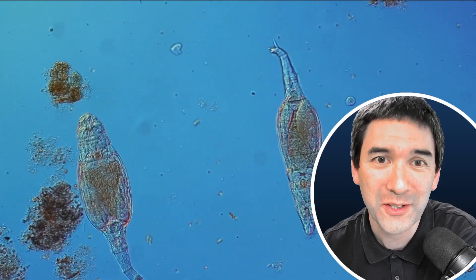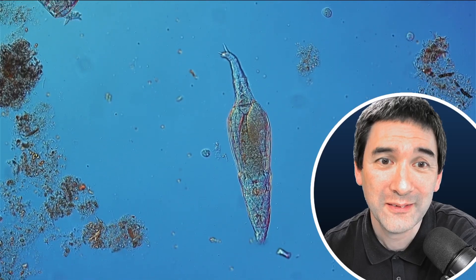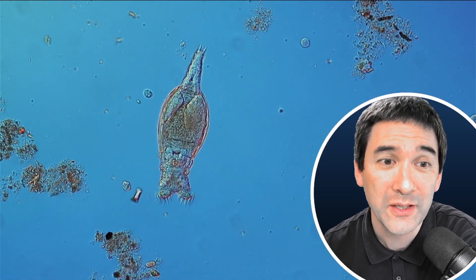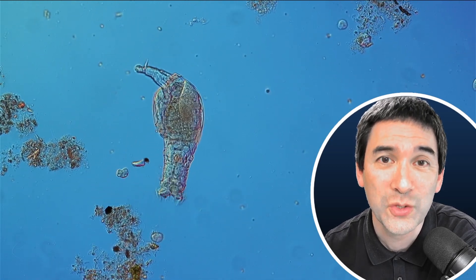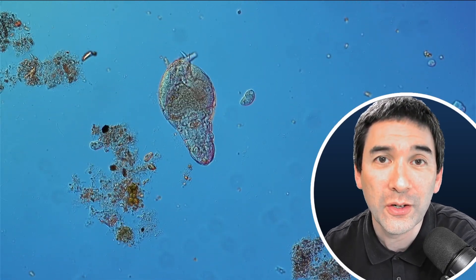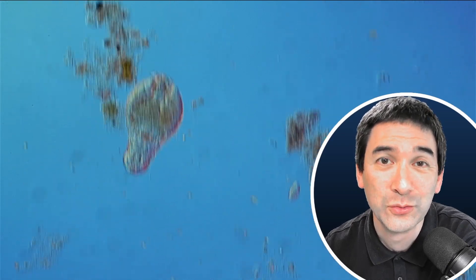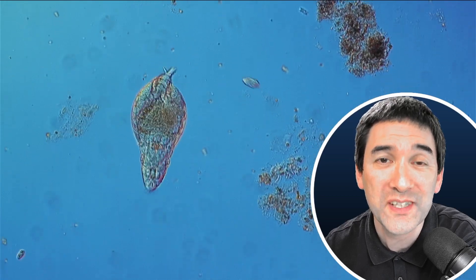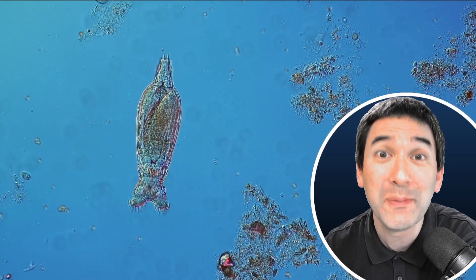Here's another one — they seem to like it in this bird bath. What they're doing is decomposing whatever falls into the bird bath. Now you can actually see how it's extending its so-called corona — that is the ring of cilia, the ring of tiny hair that are moving. This is why originally rotifers were also referred to as 'wheeled animals,' because this ring of cilia actually looks a little bit like a wheel, like a spinning wheel.